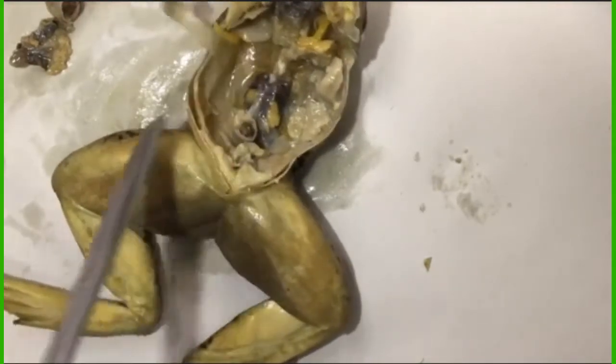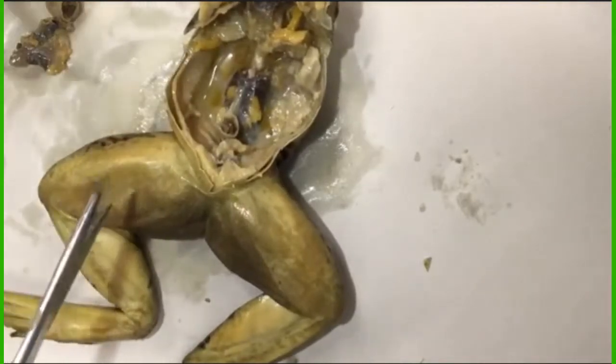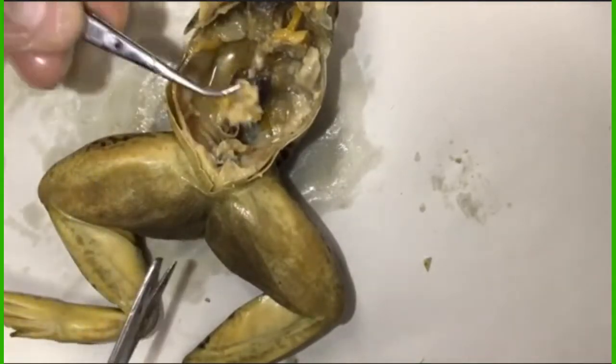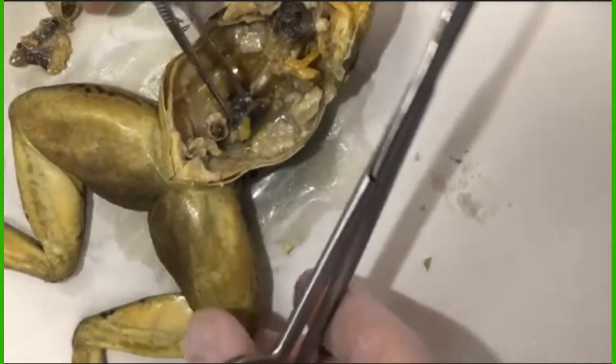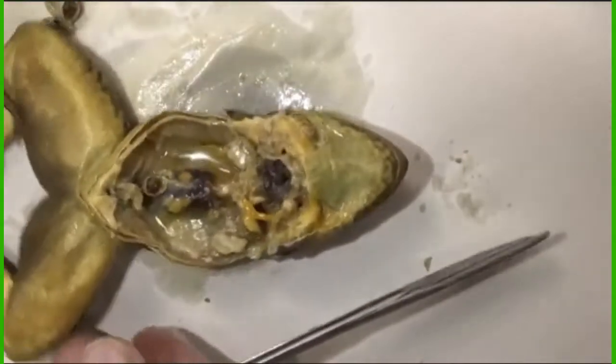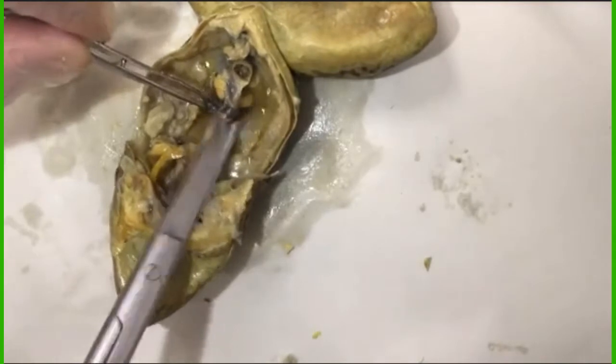The cloaca is the one all-purpose opening that they have. So a female lays eggs through there, also defecates through there, also not really urinates, but it's urates that they get rid of. And if it was a male, sperm would go through there, obviously the waste products too. So it's one all-purpose opening called the cloaca. But those oviducts lead to there because that's where the eggs are going to pass through.